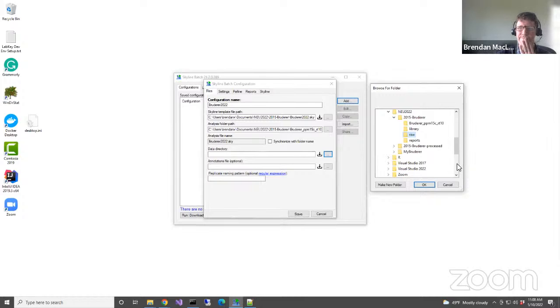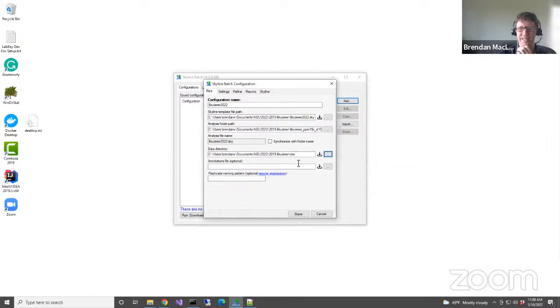And yeah, I could do this. So that would give me all my data files. Alternatively, you can see that a lot of these buttons have this button, which means that I want to download this. So let's just suppose that not everybody got all the data downloaded. So let's go ahead and change this so the data gets downloaded.